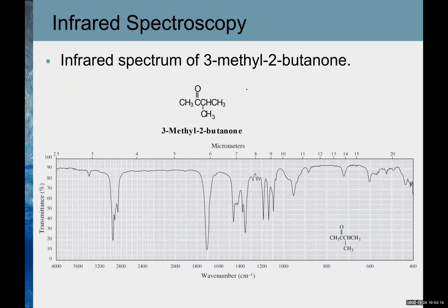Okay, so this is an example of an infrared spectrum given by a molecule, something similar, and you can see this molecule has different kinds of waves. We don't worry about it, we'll learn how to interpret this data, but for now I just want to show you the values.